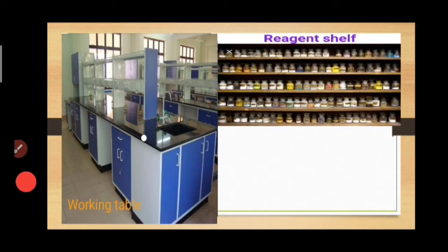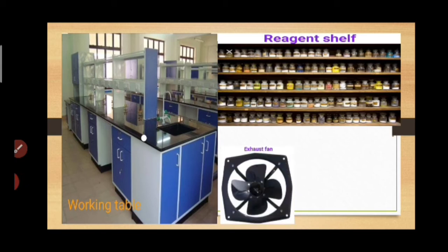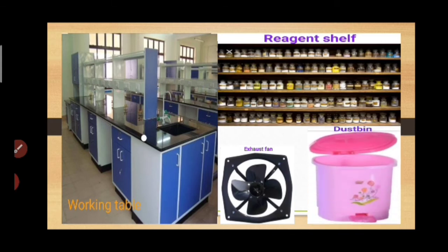A chemistry lab also has a reagent shelf where all the chemicals are arranged properly. It should have an exhaust fan to remove the smell of chemicals and poisonous gases. Most importantly, it should have a dustbin to dispose of all useless products.